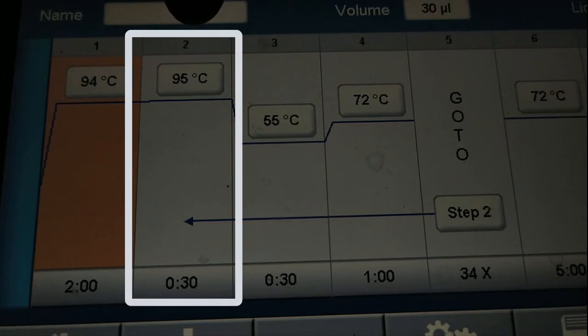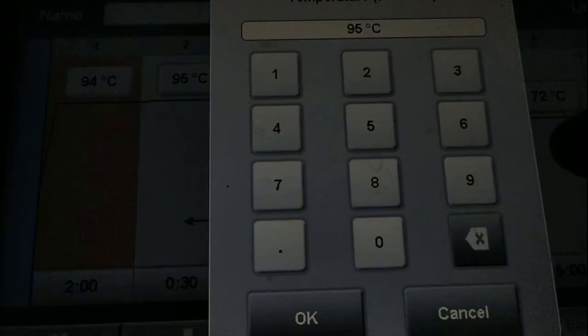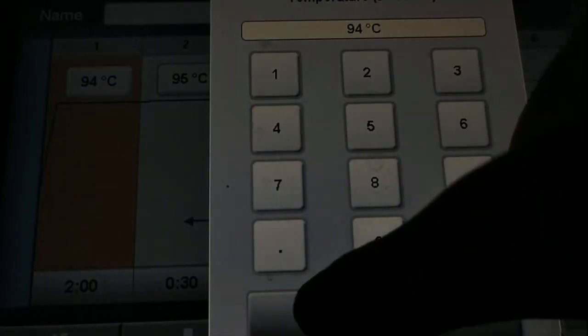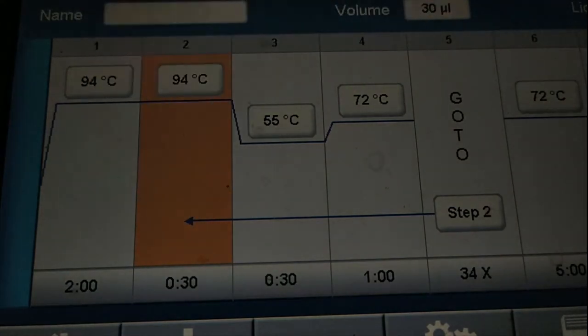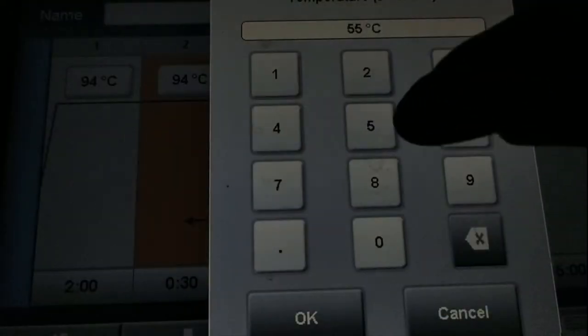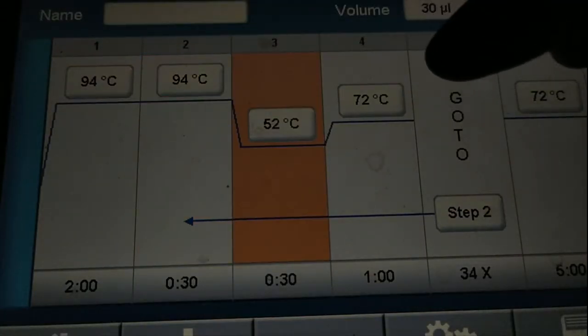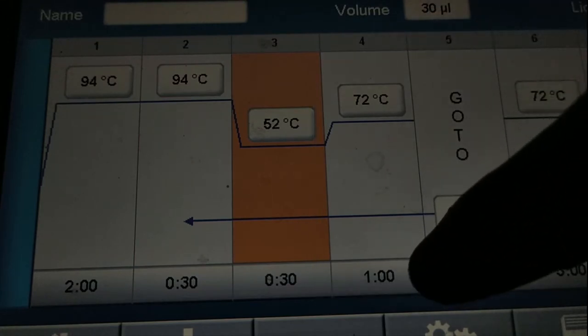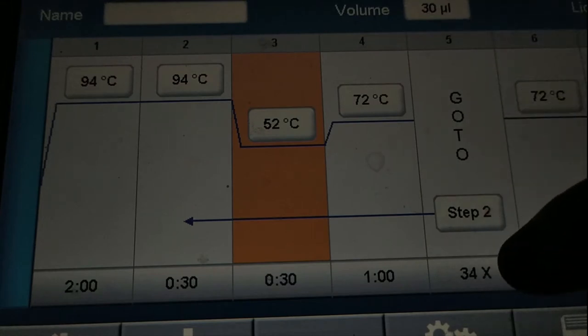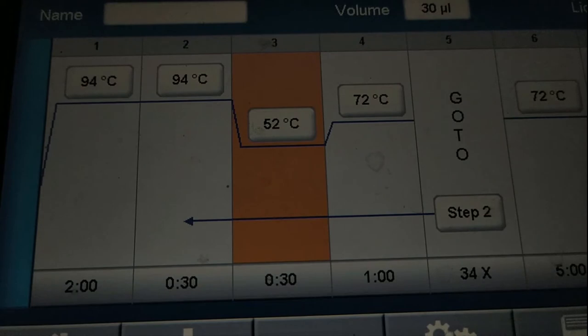Now we have the second step, the second column and it is also 94 Celsius degrees and you are going to have it for 30 seconds. Third step would be the annealing temperature and the annealing temperature is set to 52 Celsius degrees for 30 seconds. Finally we have the extension time at 72 Celsius degrees for 1 minute. Then we need to repeat the cycle for 34 times. So 34 plus 1 cycle from the beginning means 35 cycles. And on step 5 it will automatically go to the step 2 and go back and forth again and again for 34 times.